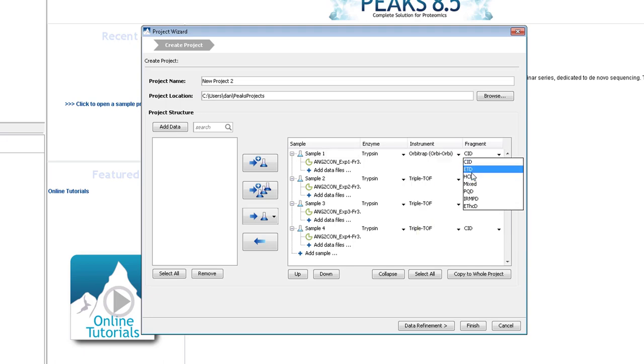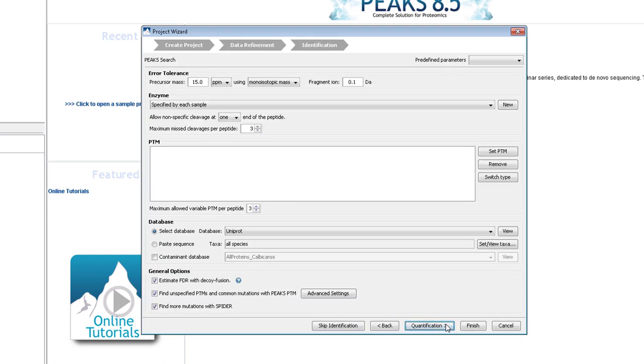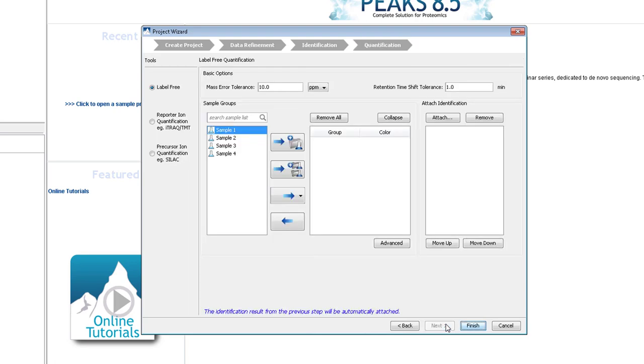Then, continue through data refinement, then identification. If you are using this project creation wizard, you don't need to add the labels as PTMs. When you set up the quantification parameters in the next step, the PTMs will be added.